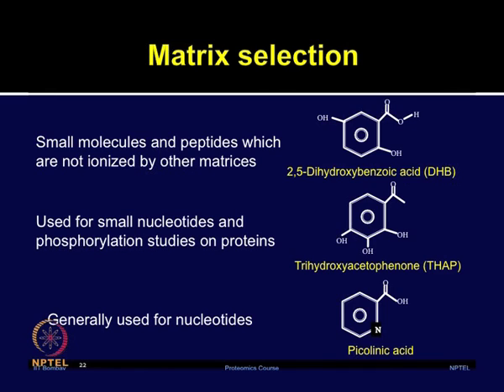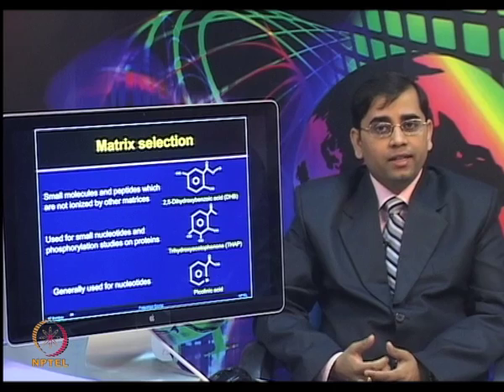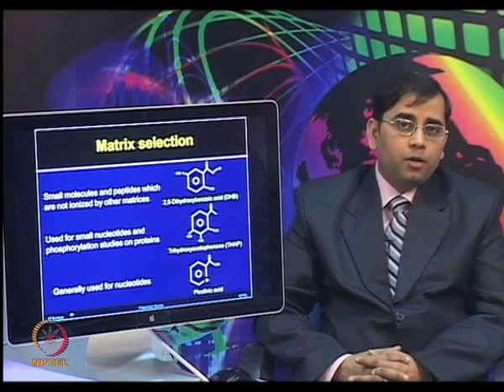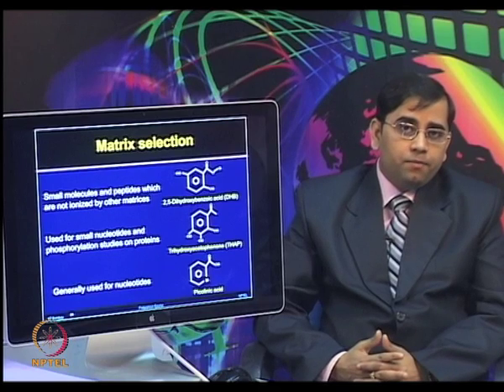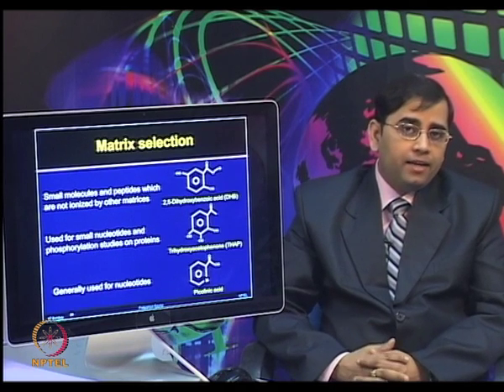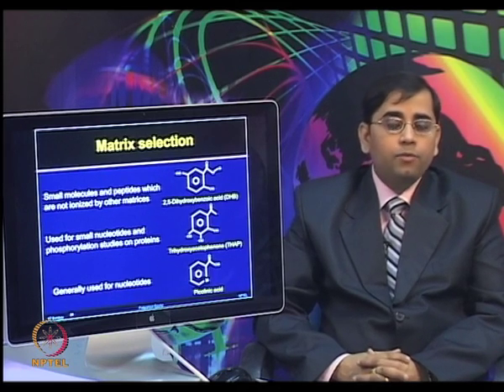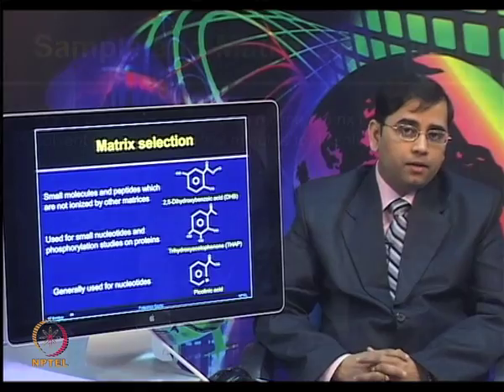Then we have picolinic acid, which is generally used for nucleotides. So, these are only a few representative matrices. As you can see, there are many options available for selecting the matrix depending on the molecular weight and the type of application. But regardless, these matrices absorb energy from the laser source and convert both matrix and analyte into the gaseous phase. The matrix can also ionize the analyte molecule by providing energy which comes from the laser bombardment.